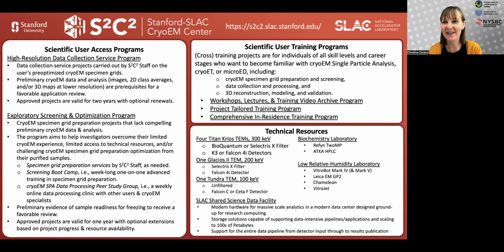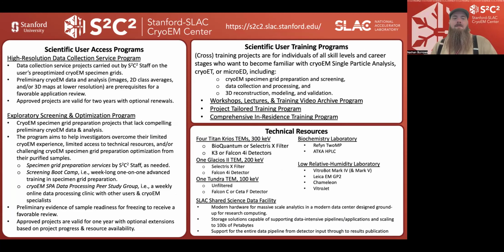At S2C2, we have our two main access programs, a high resolution data collection service. This is really geared towards labs that can prepare and optimize their own specimens, but they don't have access to a Krios level microscope to collect their high resolution data sets. Then we also have our screening and optimization program. This is geared for labs who have even less access to resources for cryo-EM, where we help users prepare and optimize their specimens. And our screening program also hosts a boot camp, which is a very intense, week-long training session to get really good at preparing specimens, basically developing lab hand skills.